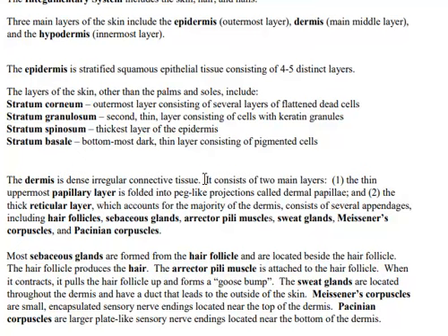You're going to find your sebaceous glands are also attached to the hair follicle because they're going to be making oil, and you want to lubricate your hairs. You want oil on your hairs so that they're not all dry and have split ends. So a lot of people get the sebaceous gland and the sweat gland mixed up, but the sweat glands are not attached to the hair follicles. And they're also much more coiled than the sebaceous glands are. So that's a couple of clues that'll help you differentiate between sebaceous, which are your oil glands, and your sweat glands.